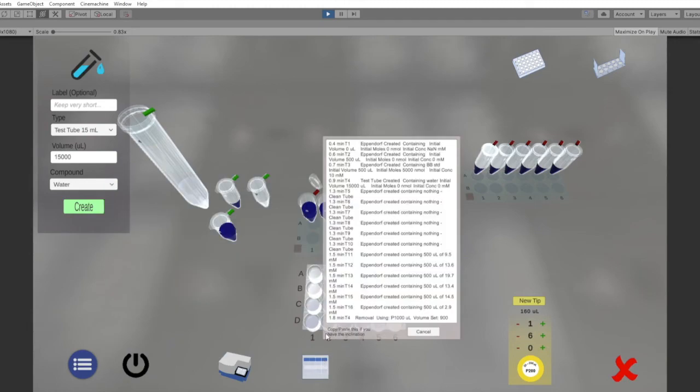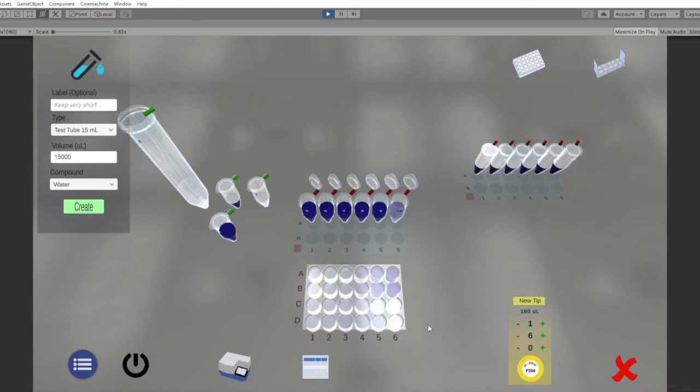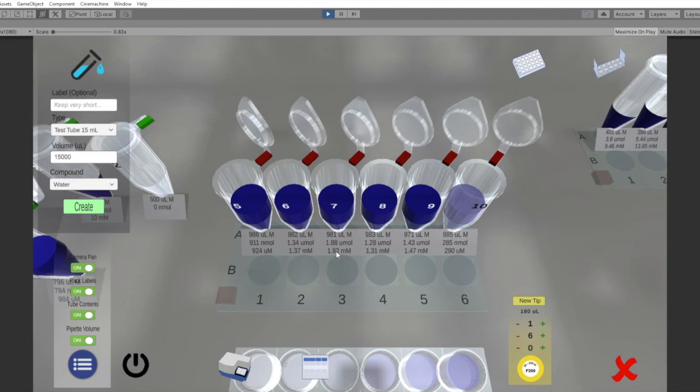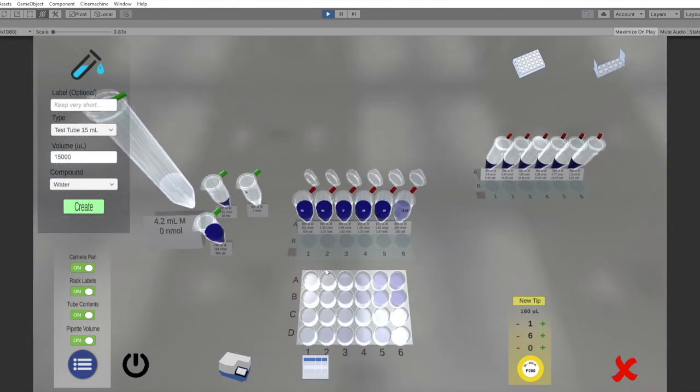And the other thing that you can get is a report on exactly every single operation that you've done. So what was put in each tube at what particular time. And that's basically it. The liquid handling, the measuring of the absorbances. There's a couple of little options that you have driven by this menu here. You have a cheat, which is actually to be able to see exactly what's in each tube. Let's hope that we might switch that off for expert use. And you can also check whether the pipettes are set to what you think they are.